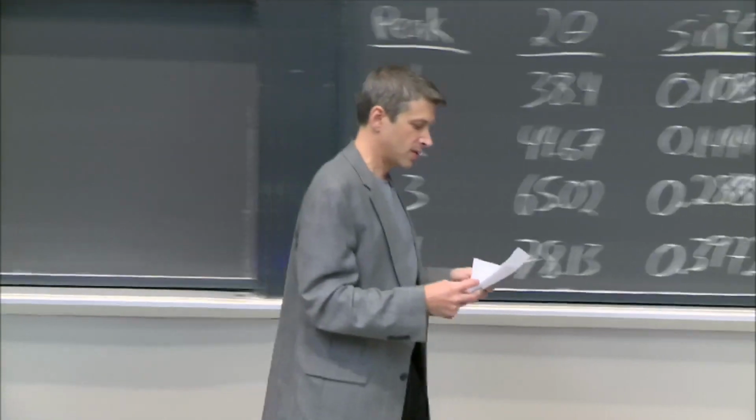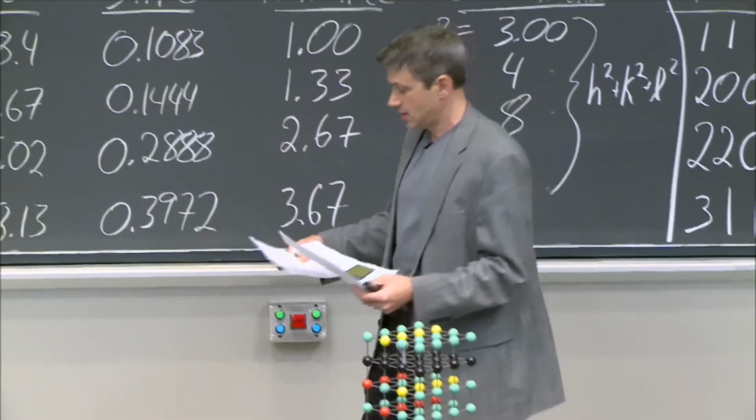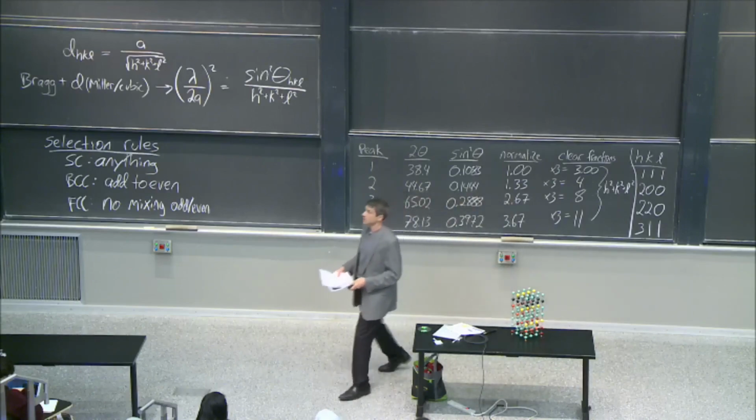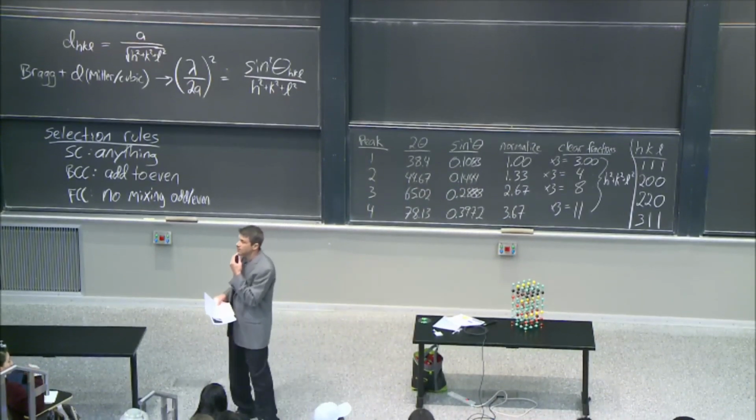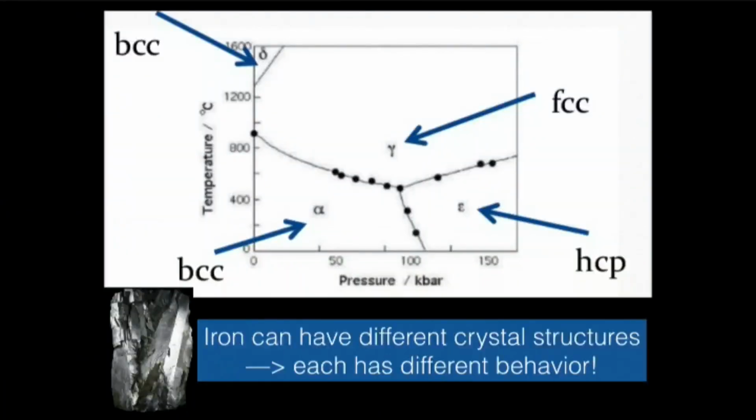With great power comes great responsibility. How you use XRD. Well, let's see. Let's use it to figure out what phase of material we have. But why does this matter, right? Well, I have a why this matters, but there's multiple reasons for why this matters.